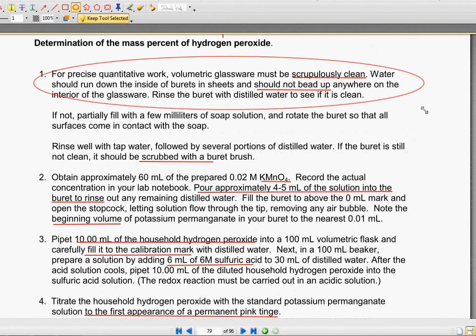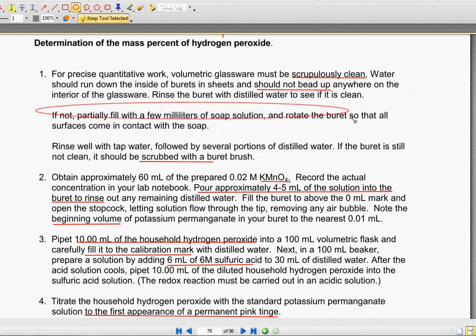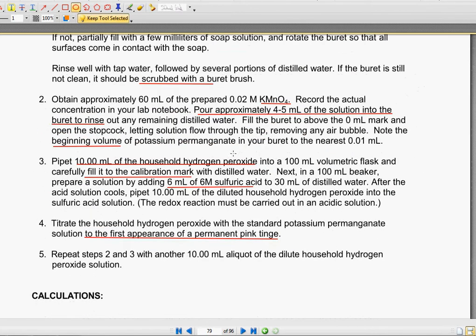So we're going to essentially make sure, we're going to have to make sure that everything's really, really clean. So you're going to have to make sure that when you pour a little bit of water, it should not bead up on the sides of the glassware. And if it does, you're going to need to clean it with soap. And if it still beads up, you're going to have to scrub it.